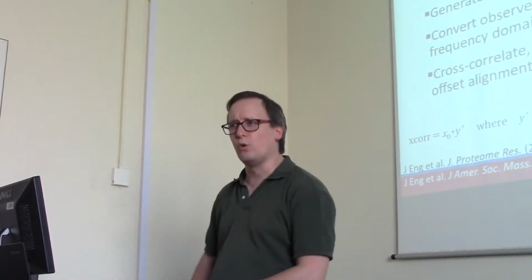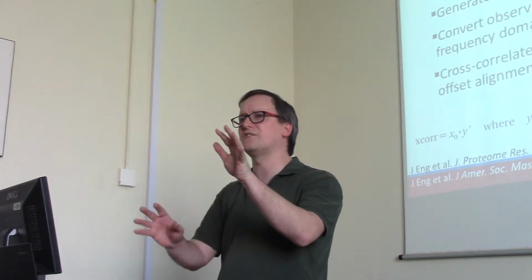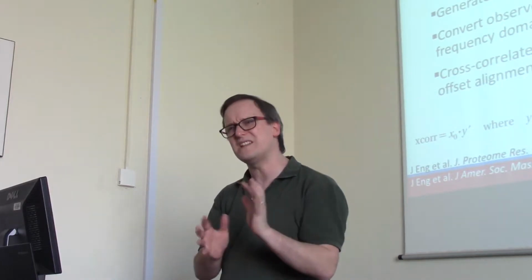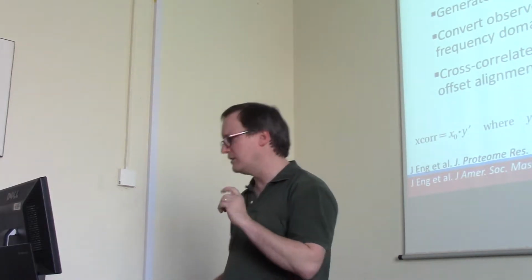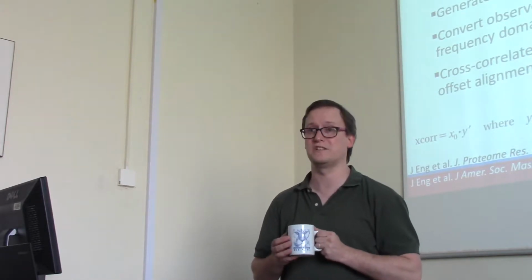Now, how do you score the set of spectra that you have against the set of spectra for the peptides that we're trying to compare to them? That is kind of an odd question. And lots of people have put together lots of interesting answers on the subject.